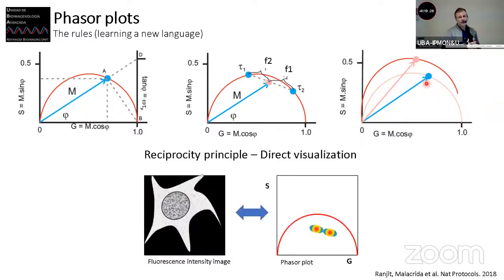But there is one very important property of the Phasor that they also pointed out early in the presentation today, and this was the big idea of Enrico of using Phasor, which is for images, we need to know where things happen. And if we do the transformation, we have a fluorescent lifetime. This is an average intensity, but we transform the data and we end up having something in the Phasor.